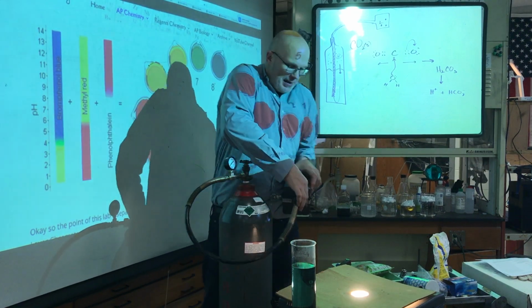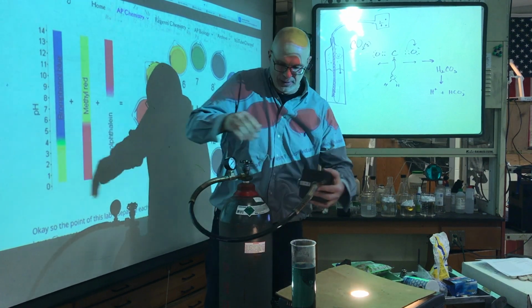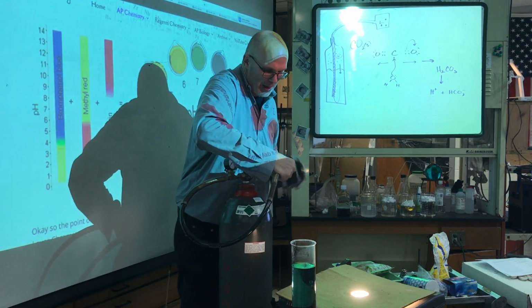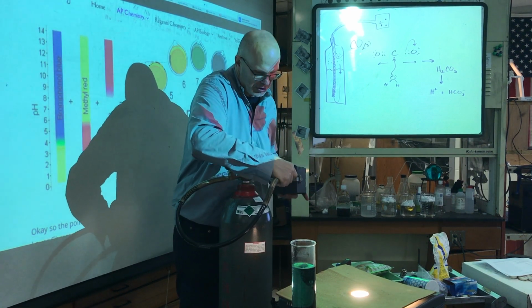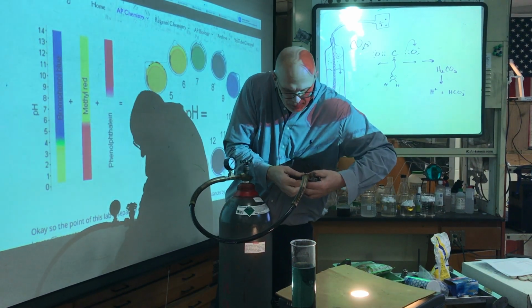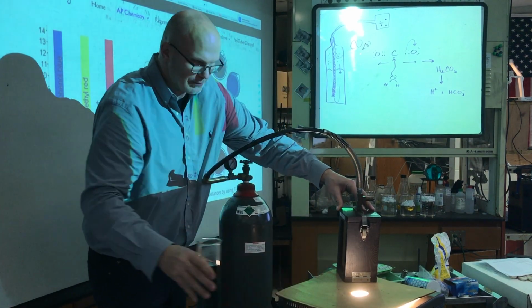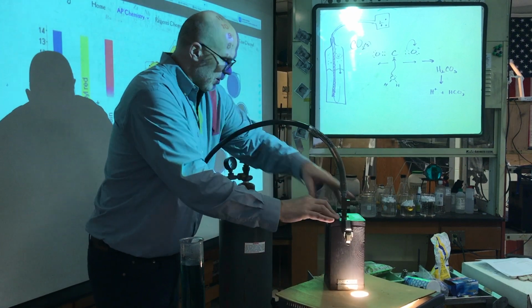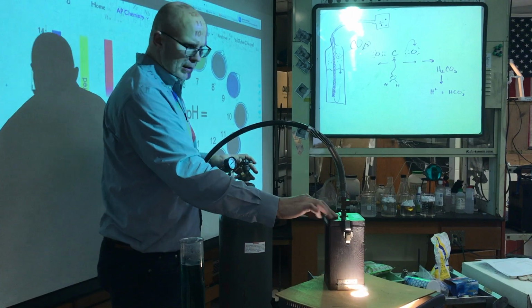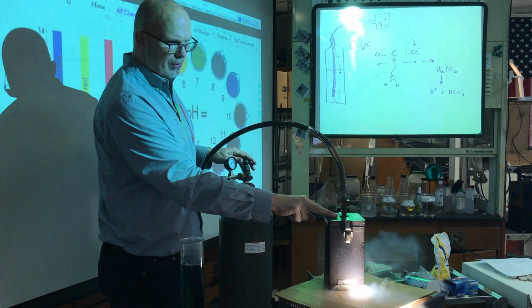I'm going to clamp it shut because the pressure is going to build up a little bit. I'm going to shoot liquid into this container here, and magically, I should make some dry ice. Except this seems a little off. Oh, we'll see what happens. Any case, without further frost. Sorry. All right, turn this on. You can actually see some frosting going on.